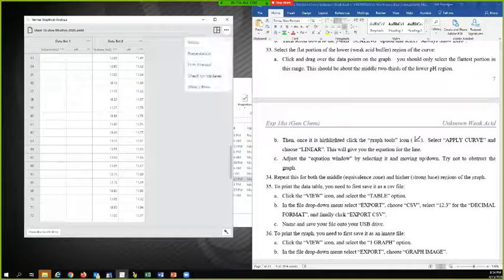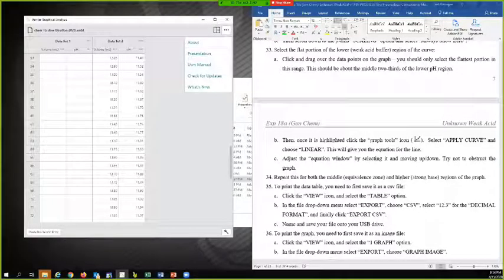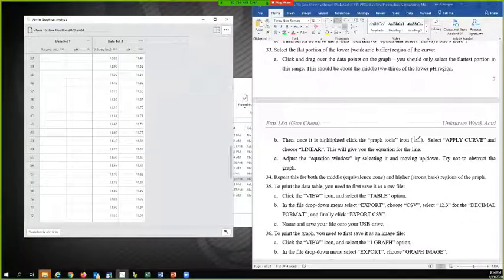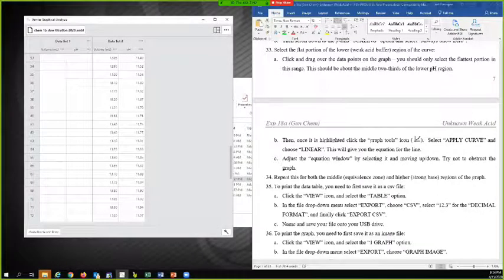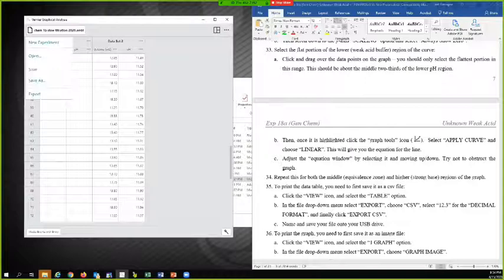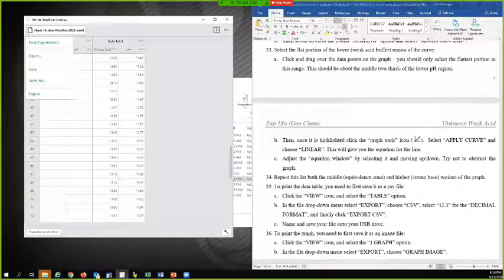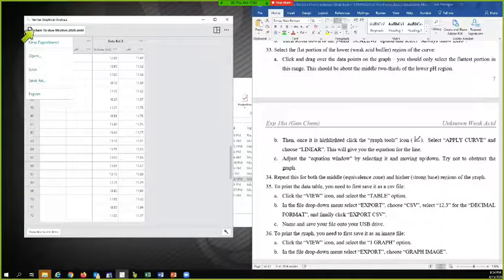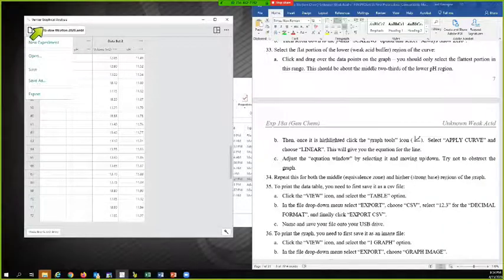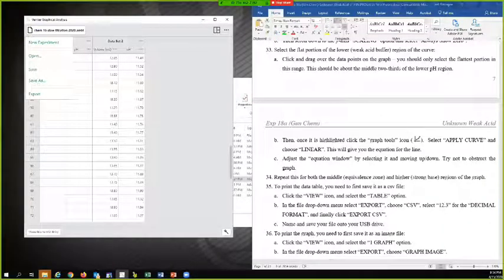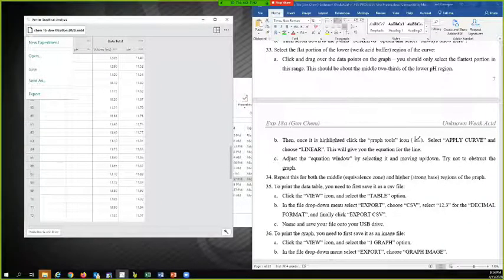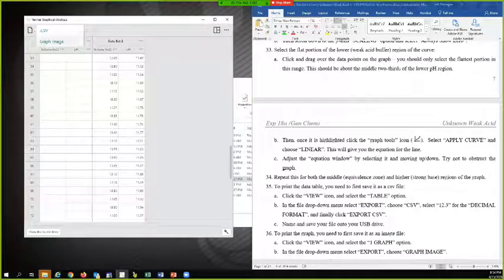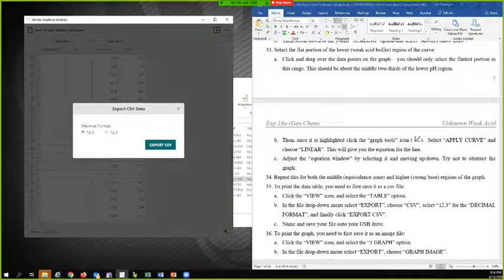There it is. So it's this button up here where you deal with files. And so I'm going to go to export and CSV.